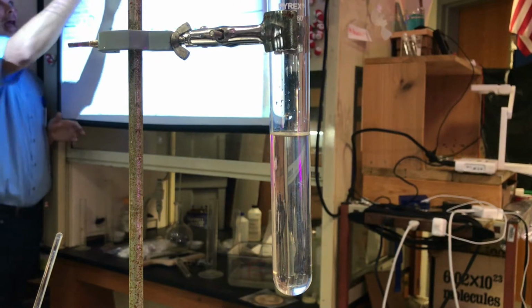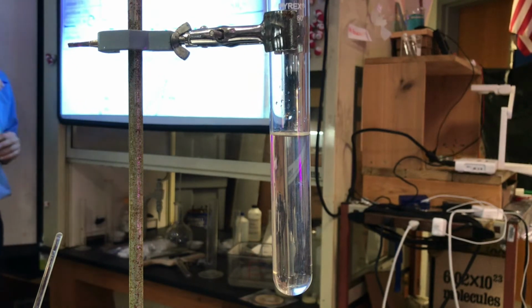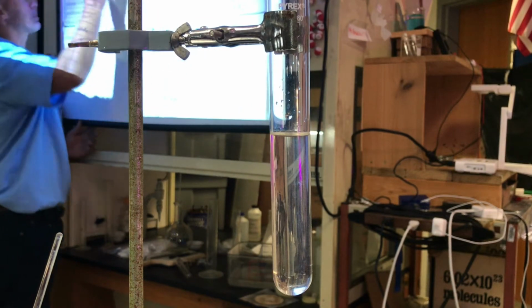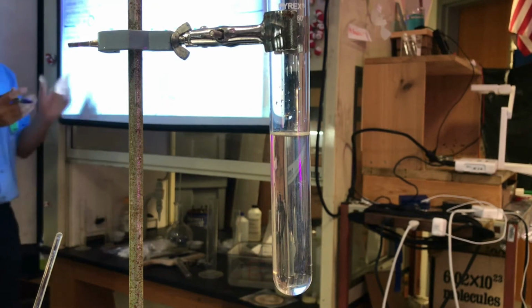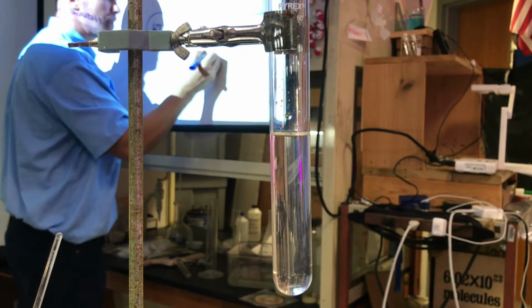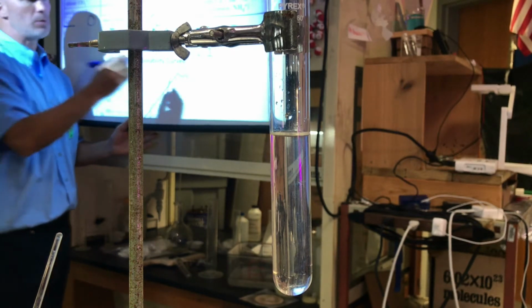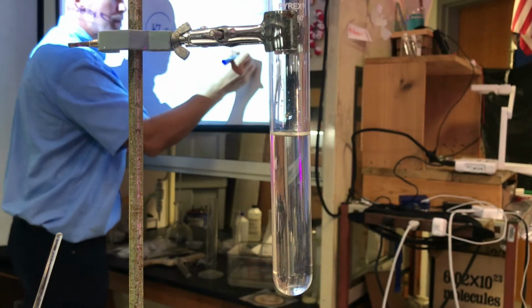When I add lead nitrate to potassium iodide, this was a double replacement reaction that we did over the summer or you did in Regents chemistry. Bottom line is, the nitrate and the K+ are always spectators, they don't do anything. So when I pour these together, the Pb2+ plus I-, and how many would I need to make a neutral compound? 2 of them, right? Because one is -1, one is +1. So what you're going to make is PbI2.